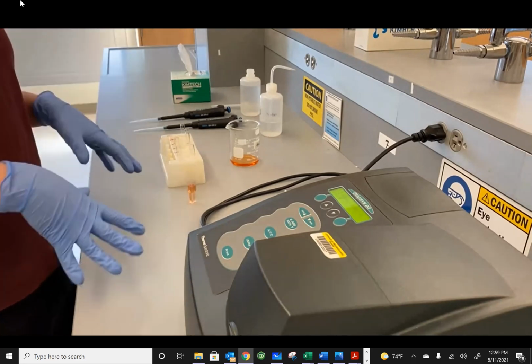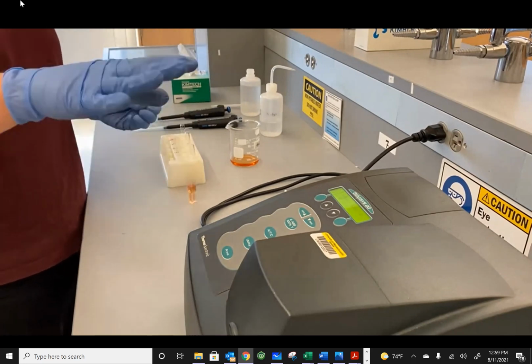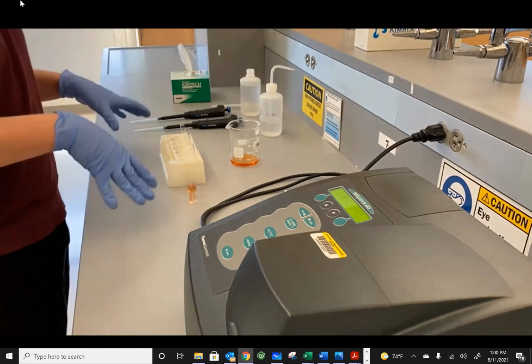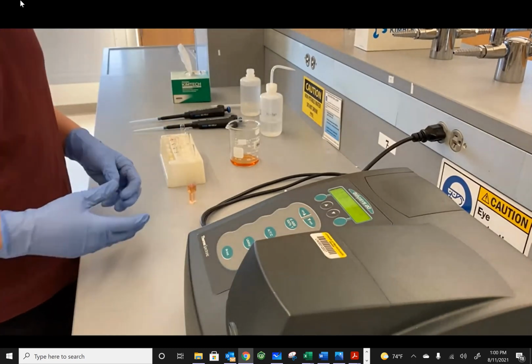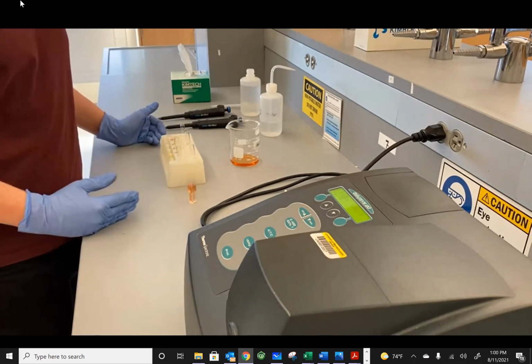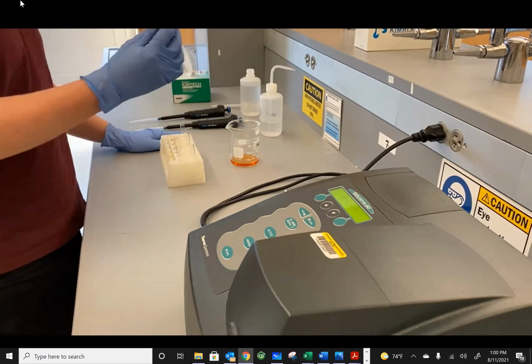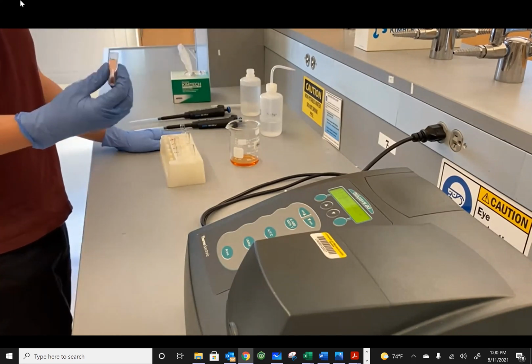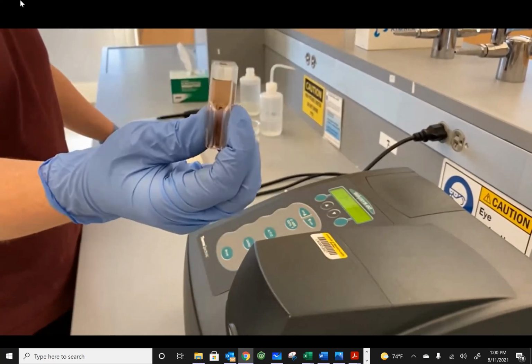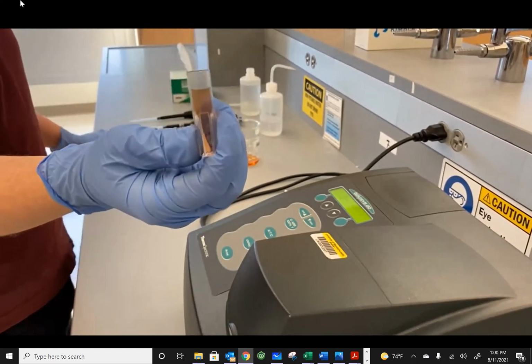To start the experiment, this is what would actually be done in the lab. In a moment, we will walk through the actual math and a little bit more of the measurements so you have a bit more orientation on how to do that. But this is the experiment itself. This experiment starts by using Beer's law to determine the concentration of the ML complex that is formed in each test tube that you make. In order to determine the actual relationship in Beer's law that this compound experiences, we will take a standard concentration of the ML complex. This is a known concentration of our species, and we will measure it in a spectrophotometer.